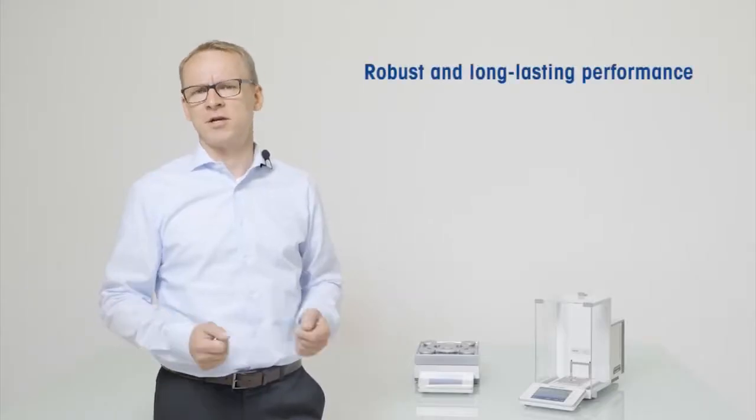Hello and welcome to our product demonstration video of the Mettler Toledo XSR analytical and precision balances. XSR line balances are developed to deliver robust and accurate results day in day out over many years.